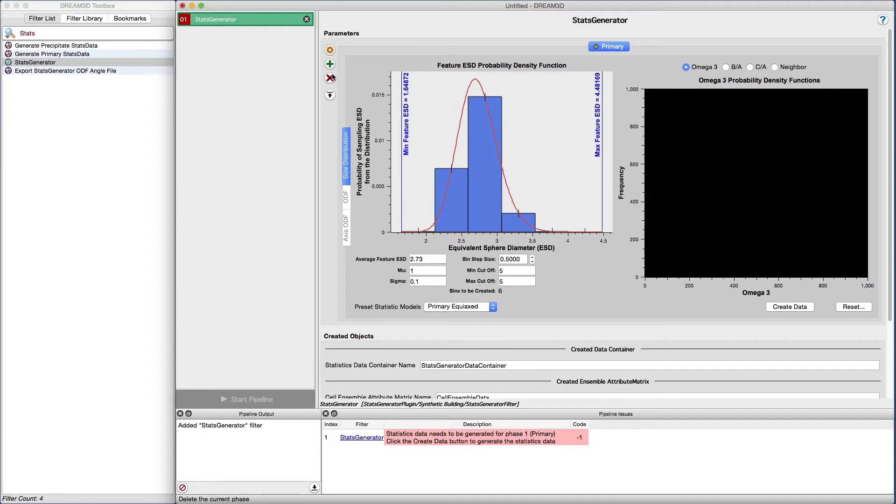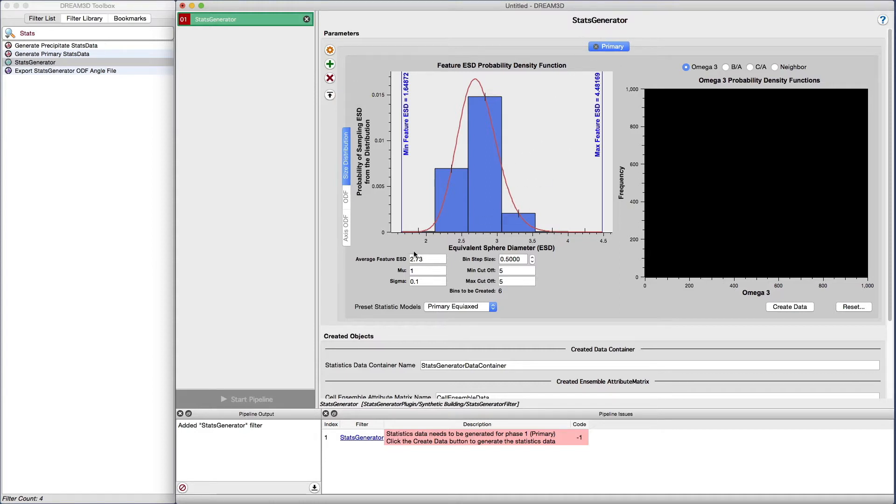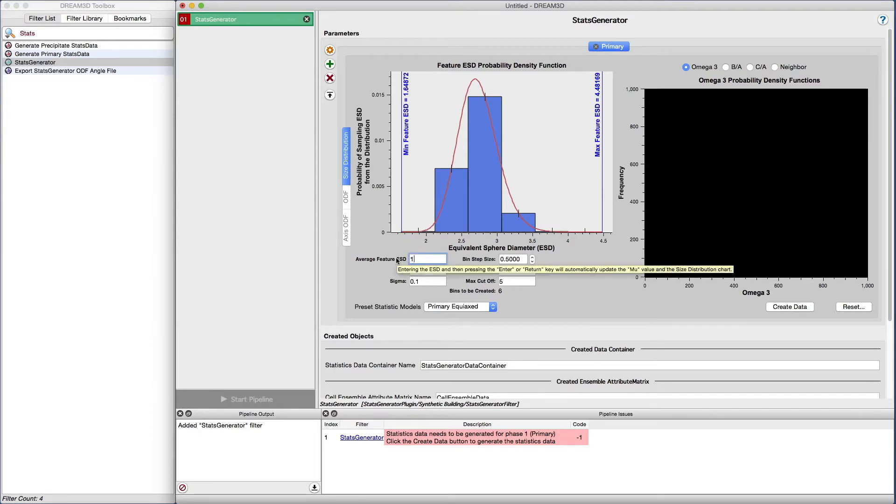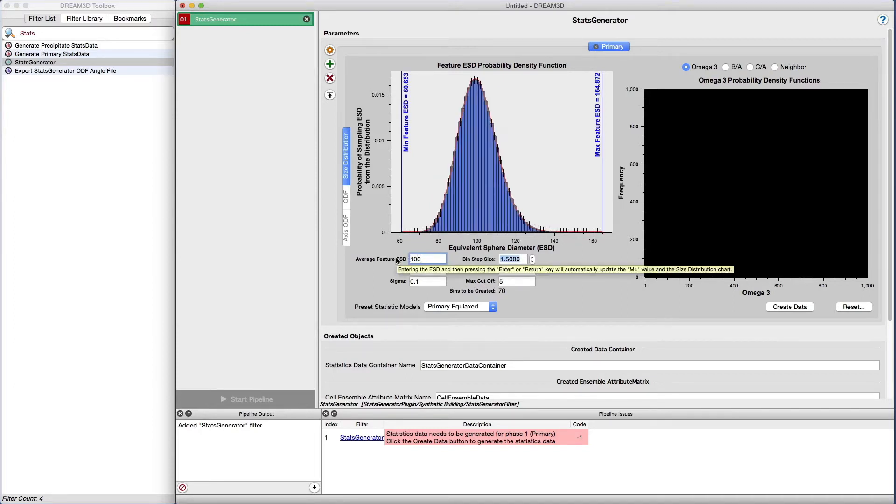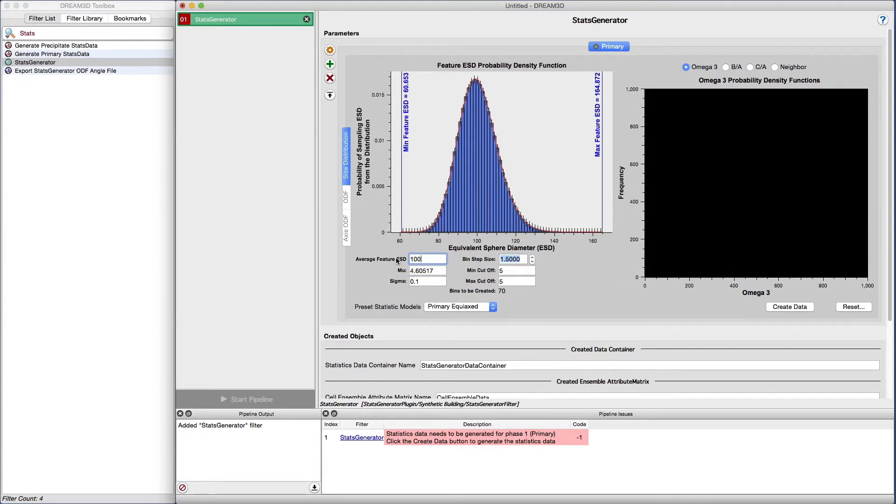The default average feature equivalent sphere diameter is set to 2.7 length units. The user interface has been updated with an additional input field to allow the user to directly enter the average feature ESD. For this example, we're going to enter 100 into the input field and press the enter key. Notice how the rest of the input fields are automatically updated based on the entry.